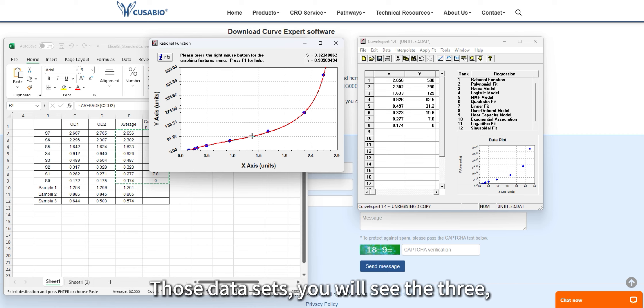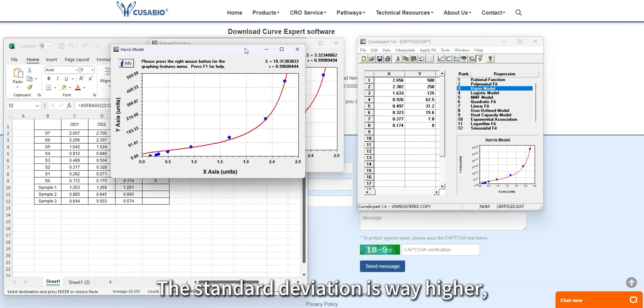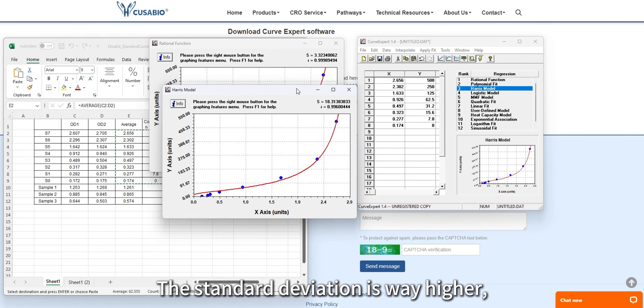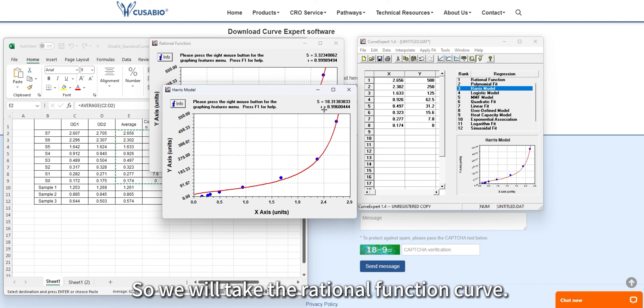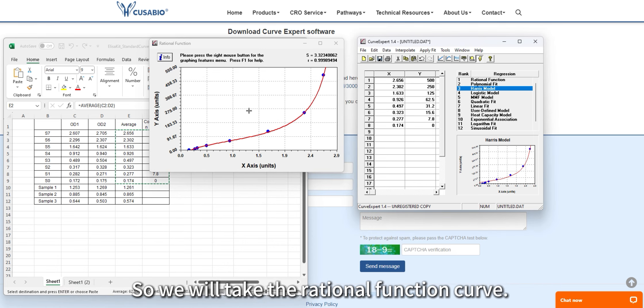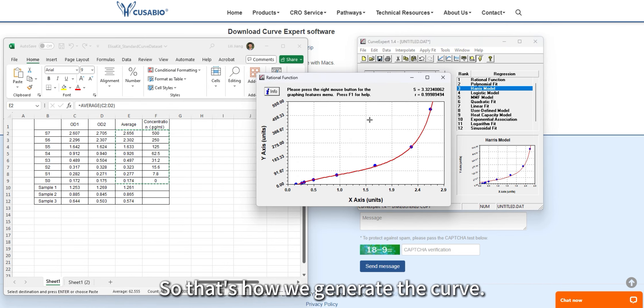The third-ranked Harris model has a much higher standard deviation, and the R value is smaller than the top-ranked rational function. So we will take the rational function curve. That's how we generate the curve.